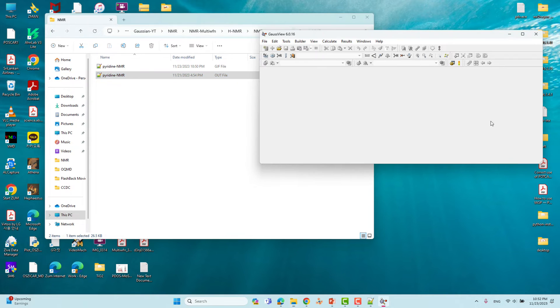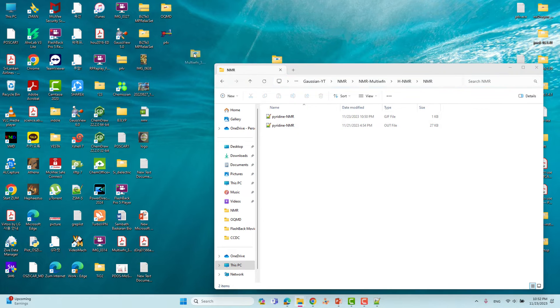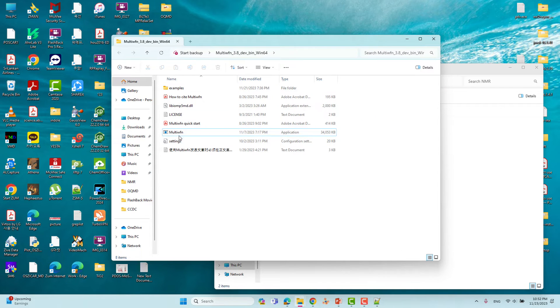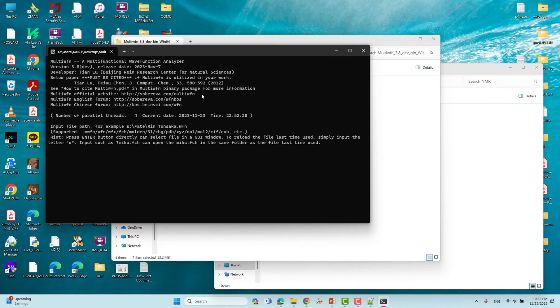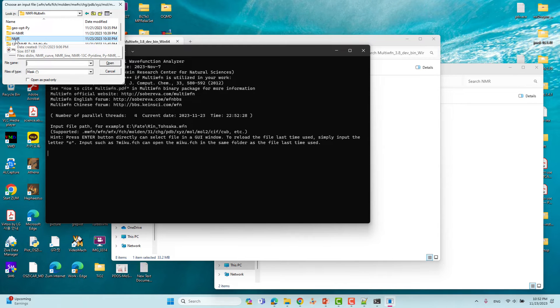Now we will use Multiwfn to get the proton NMR spectra. I downloaded Multiwfn from the website — I will provide the download link; it is open source and free to use. Open the Multiwfn application by double-clicking it. A terminal window opens — press Enter, and navigate to your NMR calculation folder.